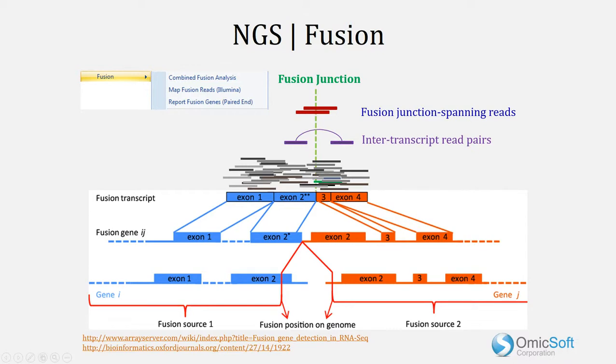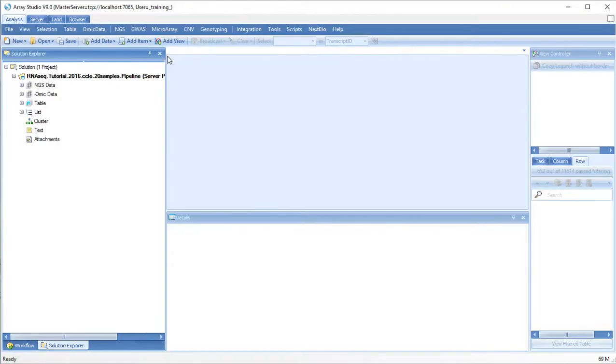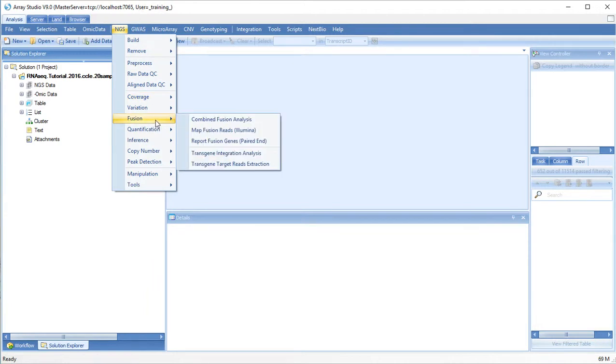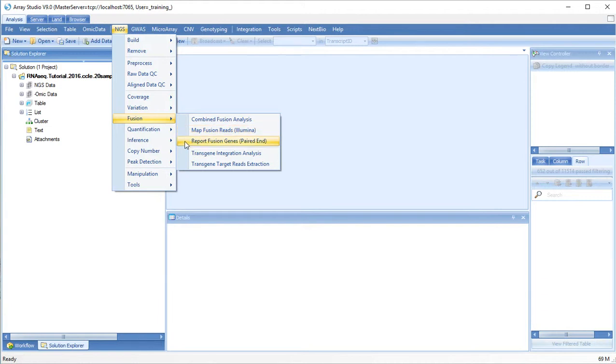The RNA-seq pipeline will automatically run fusion map analysis for single-end reads and combined fusion analysis for paired-end reads. Fusion analysis modules can be found under NGS-Fusion. You can run combined fusion analysis or only the fusion map analysis or to report paired-end fusion genes.